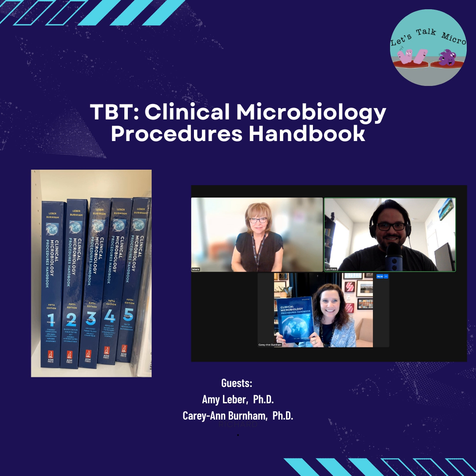And then, as it turns out, as many of us are well aware, some of what we do in the micro lab might not be well documented in the literature. It might come from a wealth of experience, something you've done hundreds of times. And so we do try to have authors who have a lot of expertise in each area leading those chapters. So all of that comes together, and the chapter author would go ahead and write it into the SOP in the prescribed format, and then it would be reviewed by the section editor. So literature, guidance documents, lab director experience.